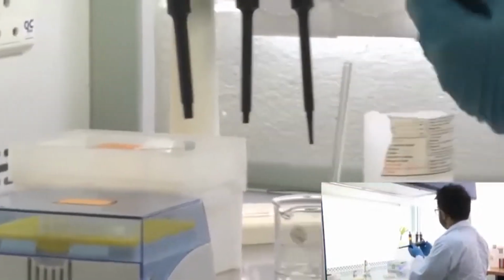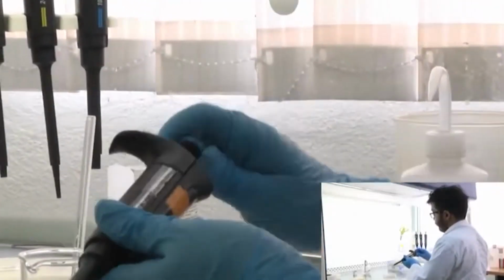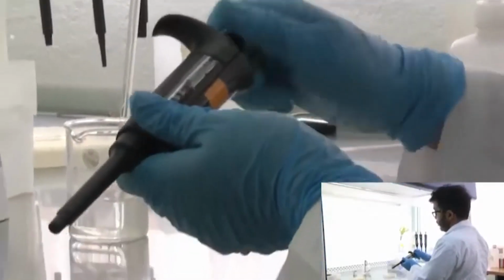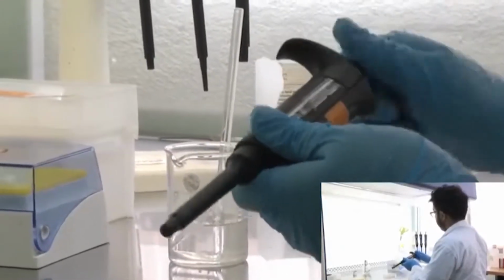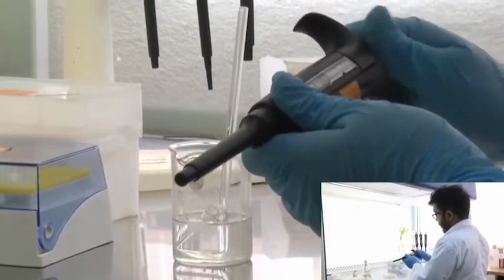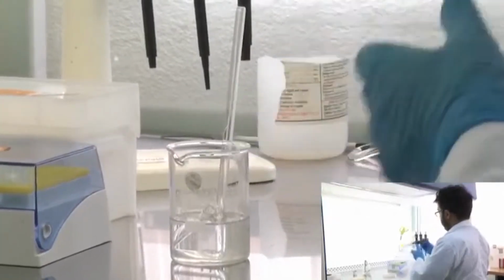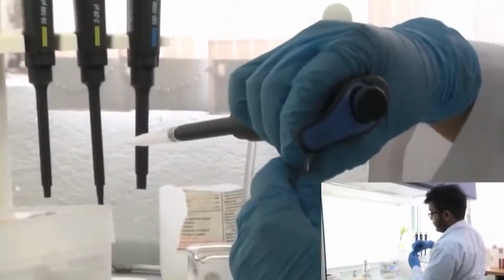So I'll just use this pipette. They're both the same, it's just that I prefer using my own pipette. I'm going to set the volume at 200 microliters, and once that is done, I'm going to take 200 microliters of this.